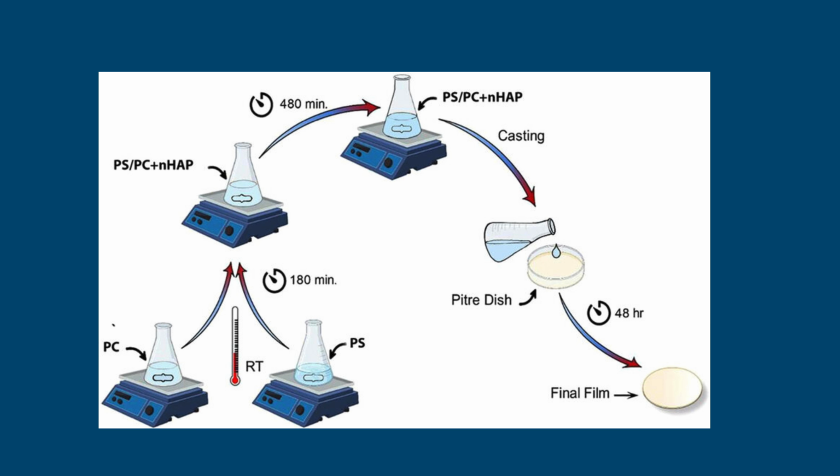The preparation process typically begins with the dissolution of the polymer using stirring or ultrasonication to ensure homogeneity. The resulting solution is then uniformly spread onto a clean substrate. Controlled drying under defined temperature and humidity conditions allows solvent removal and film formation. Finally, the dried film is carefully removed from the substrate. Throughout this process, strict environmental control is required to minimize contamination and defects.